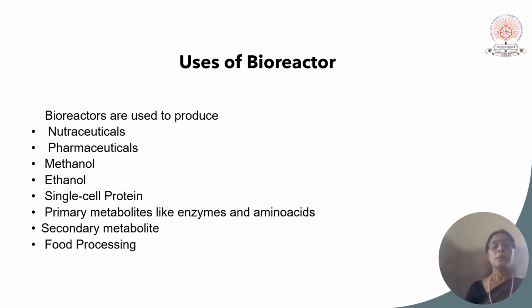These are the different applications of the bioreactor. It is used for the production of nutraceuticals, pharmaceuticals, methanol, ethanol, single cell protein, primary metabolites, secondary metabolites, and food processing.